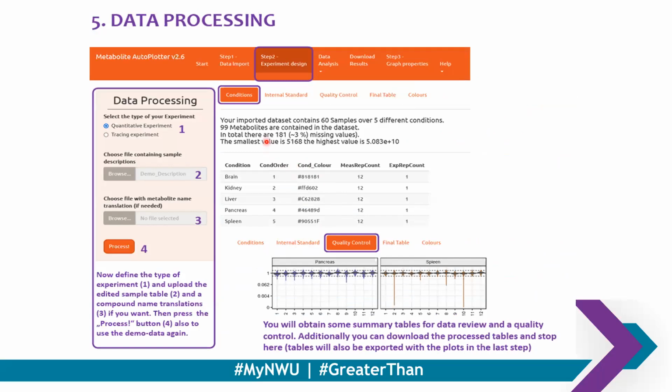After doing that, it tells you the next step. On this first side, you upload the sample arrangement, how you want the system to recognize it. Then the second aspect is the place where you upload your data.